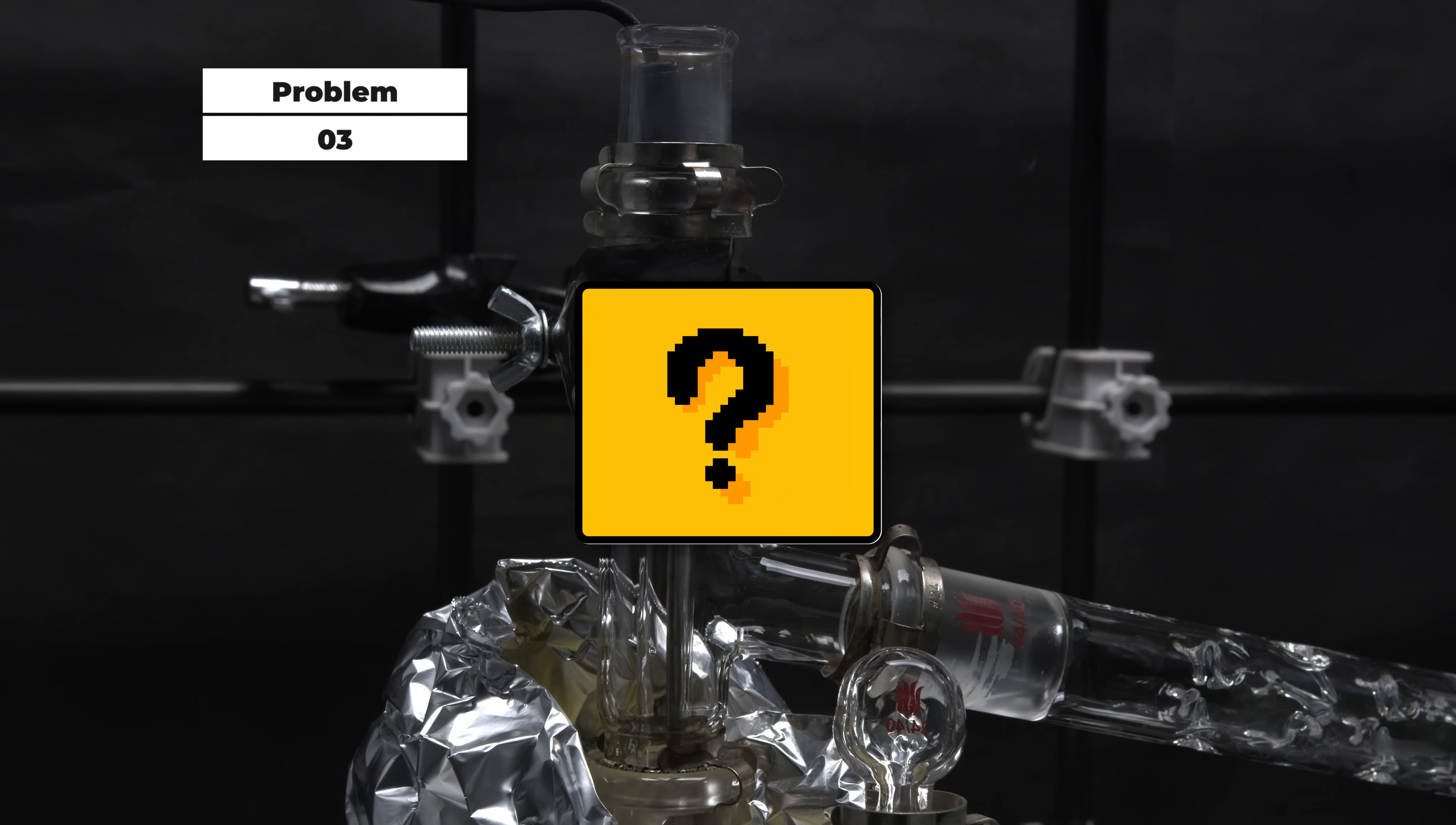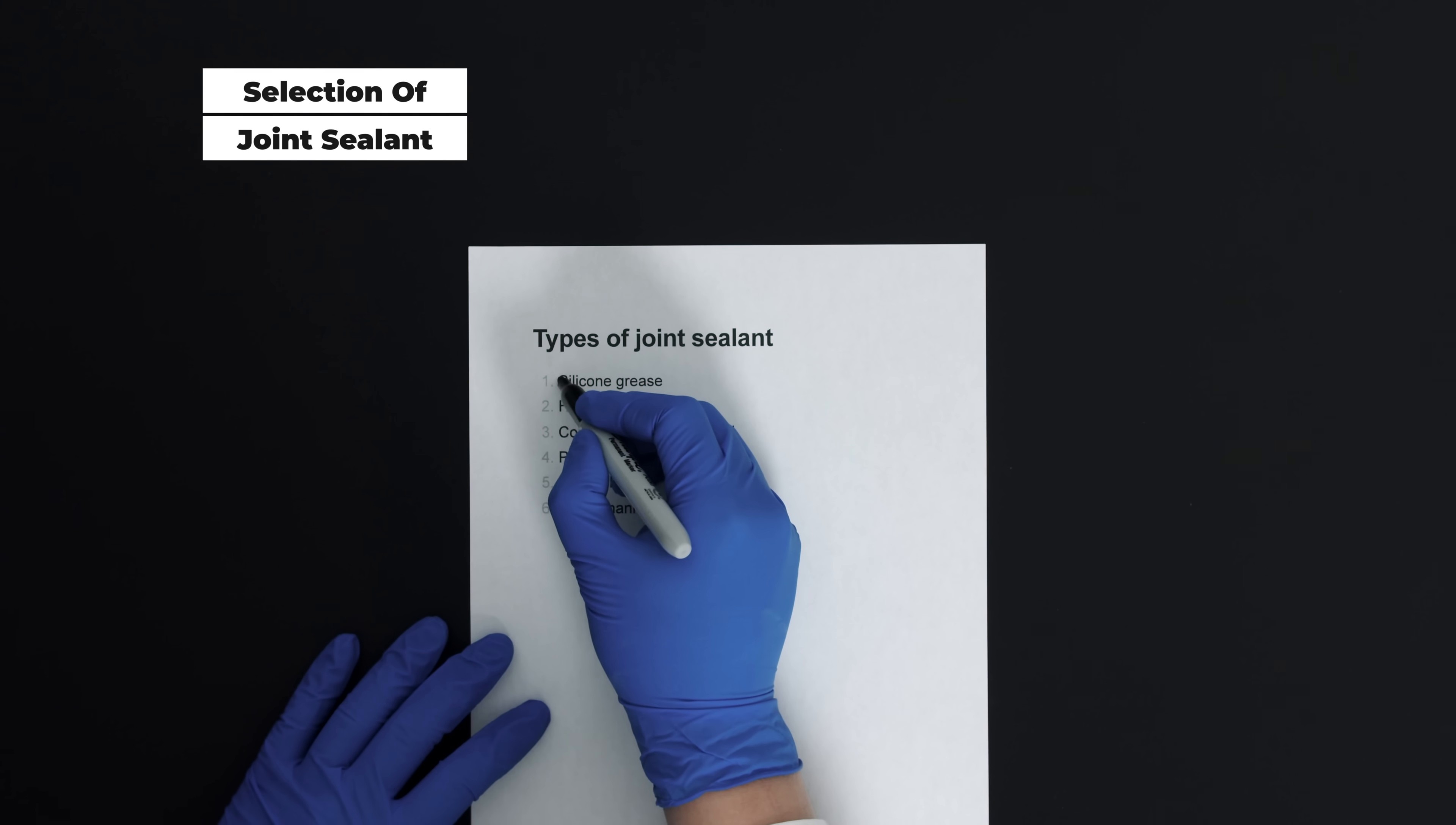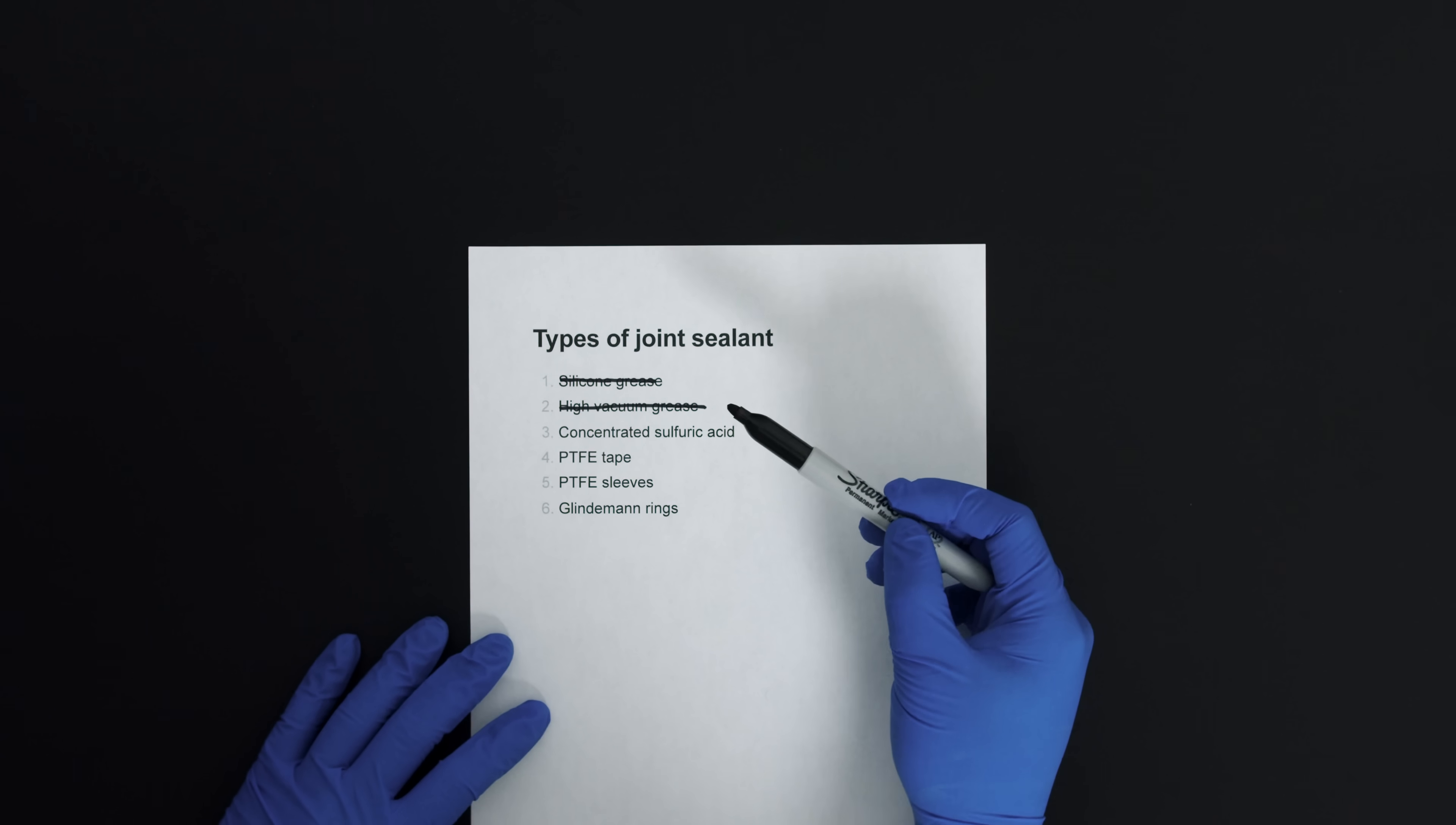And here comes problem number 3: leakage during the distillation. It is rather common for leakage to occur in this experiment, especially when the setup reaches the boiling temperature of 98% sulfuric acid. It is however not a big deal compared to the first two problems, but it can still cause issue for you and your surroundings if not managed properly. The problem exists simply because joint sealants are very limited for this experiment. Sulfuric acid is highly corrosive and oxidizing at high temperatures.